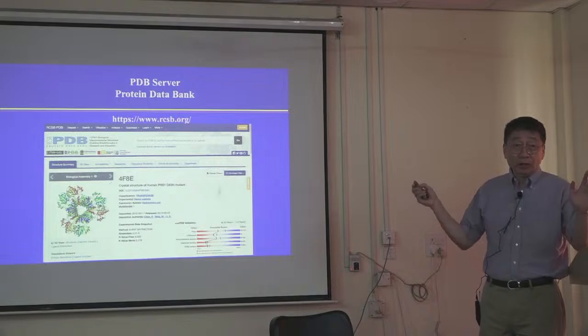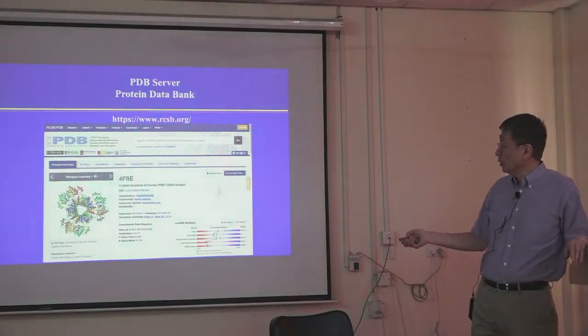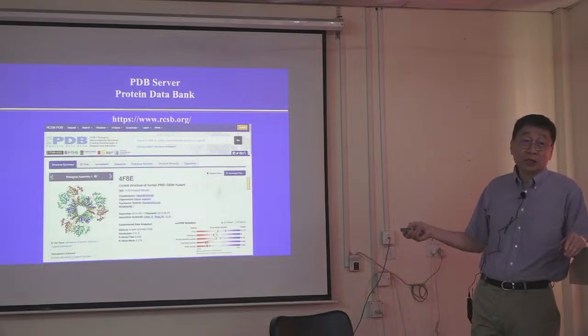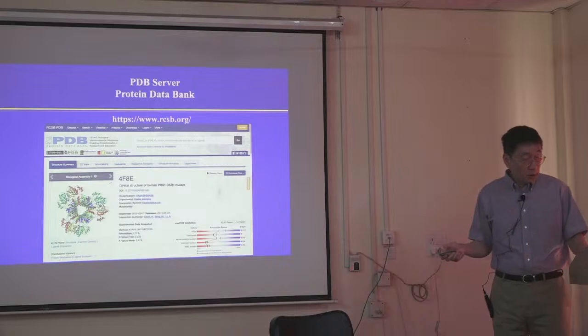So PDB, you all know, so I won't spend much time talking about it. This was already explained. Okay? Resolution is somewhere here. For each structure in the PDB, you can see the resolution of that structure.